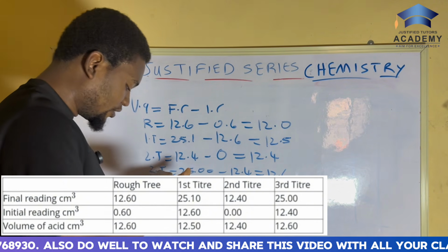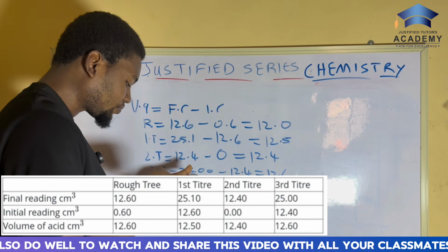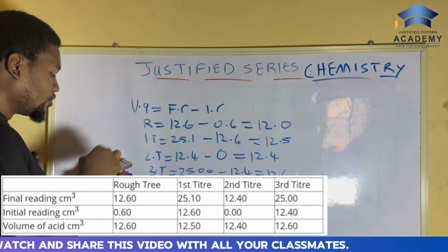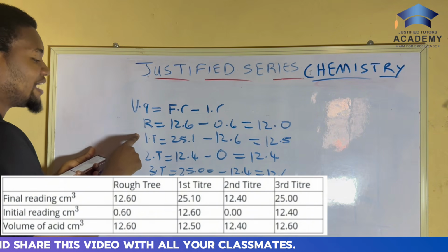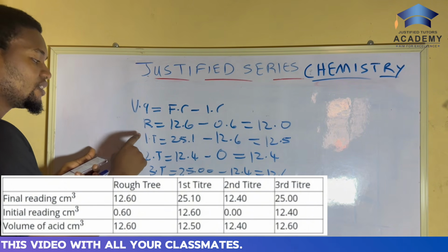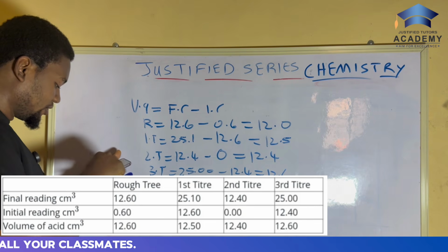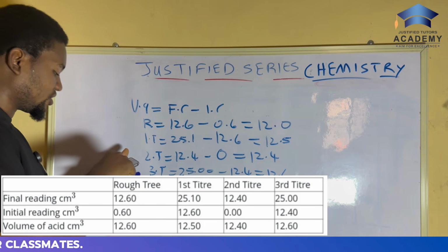So you get. I think we have one like that. Sorry, everybody, please pay attention. You should always add just the first titer value, second and third. If there's no third, you add just the first and second together, right? So I don't make a mistake. I'm correcting it for you guys. Okay, so that's it, guys.